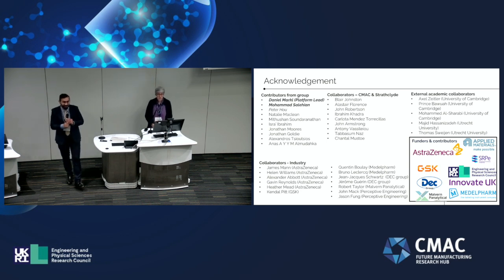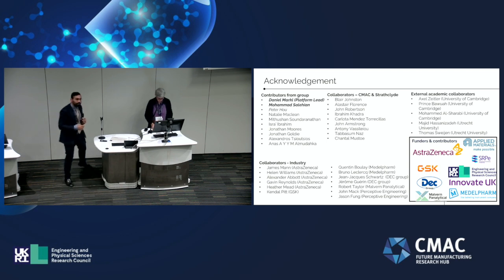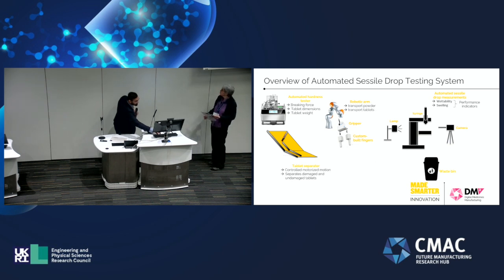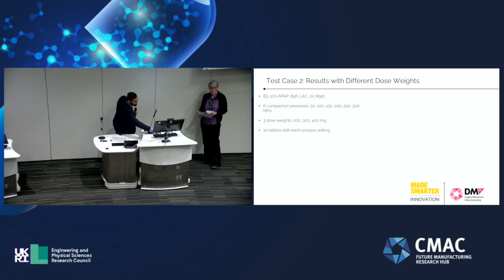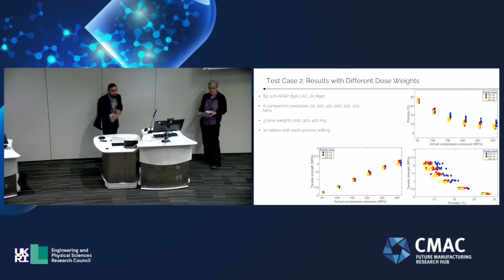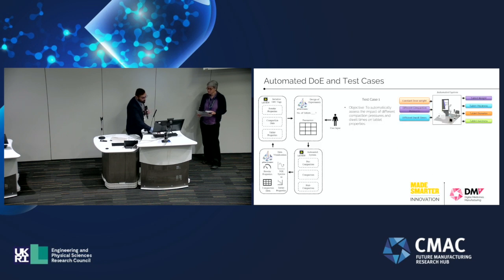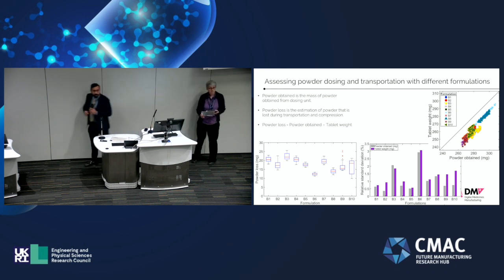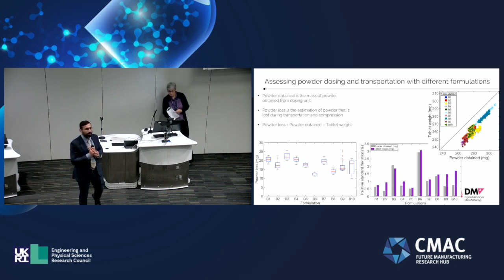Hi there. Nice presentation. In one of the graphs you showed, related to dosing weight versus what the actual dosing delivered, it seemed like there was a systematic underdose or overdose. It was hard for me to tell from the graph. I think it was underdosed, but probably in this case. There was almost like a Pareto plot. This one? Yep, exactly. So is that hard to correct for? Is there something preventing you from getting those points on the line?